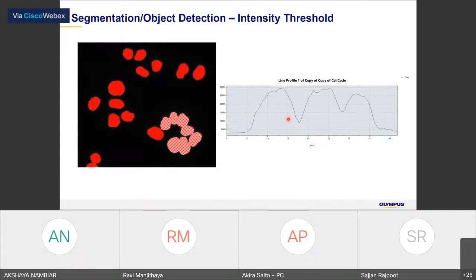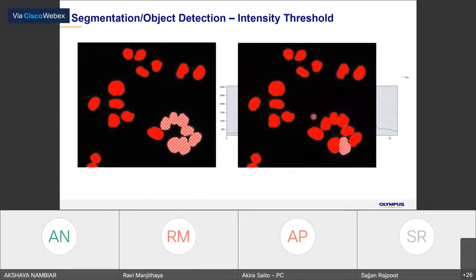So you can see the peak over here and here and here, and the gap over here and here, so that it will cut the object over here and here. In our software, we just call it auto split, but there is this kind of algorithm in most of the image analysis software.